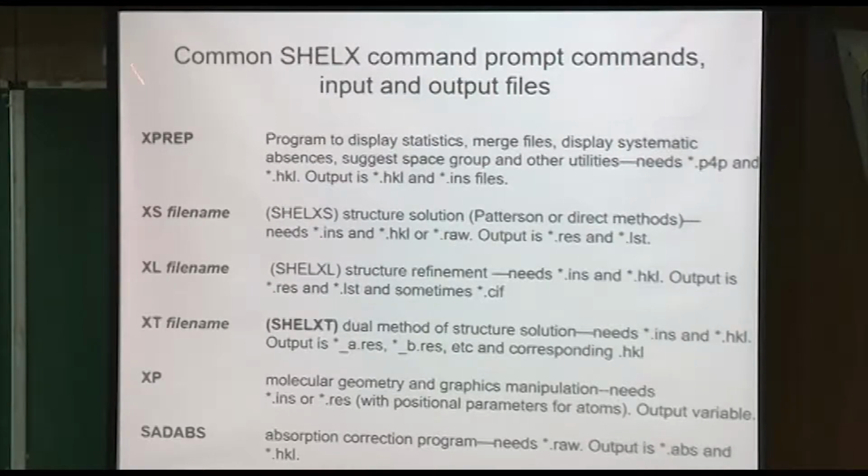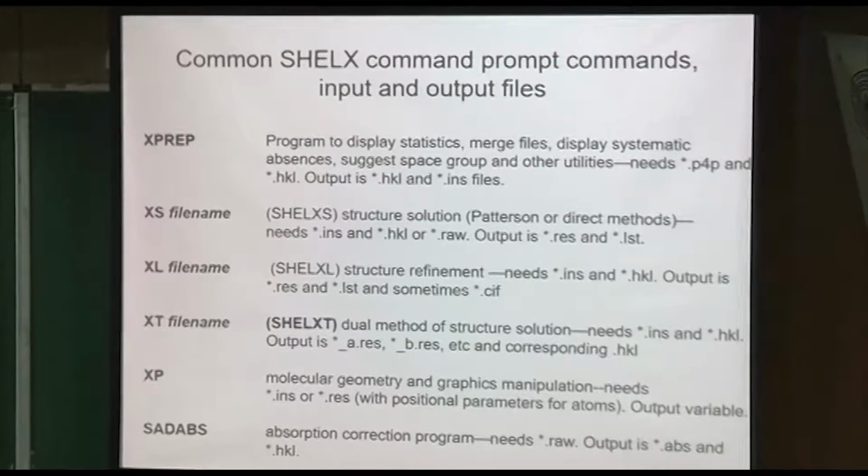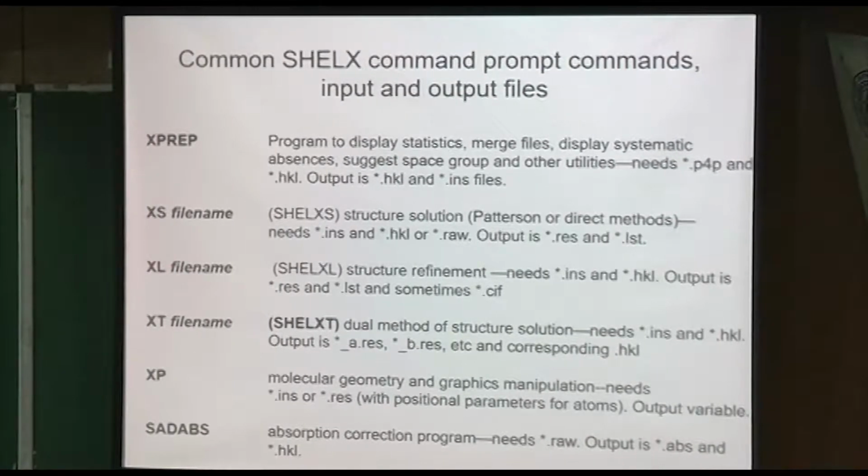Now, to run the SHELX programs from the command prompt, it's generally just a matter of writing one of these names followed by a file name or maybe a couple of file names. So it's not too horrendous. Let's start with SADABS. That was the absorption correction program. It's going to ask you for raw files, and that's all, just raw files. Then sometimes you do need to go back and rerun it for one reason or another. So you might keep the raw files handy until you're sure that you're done.